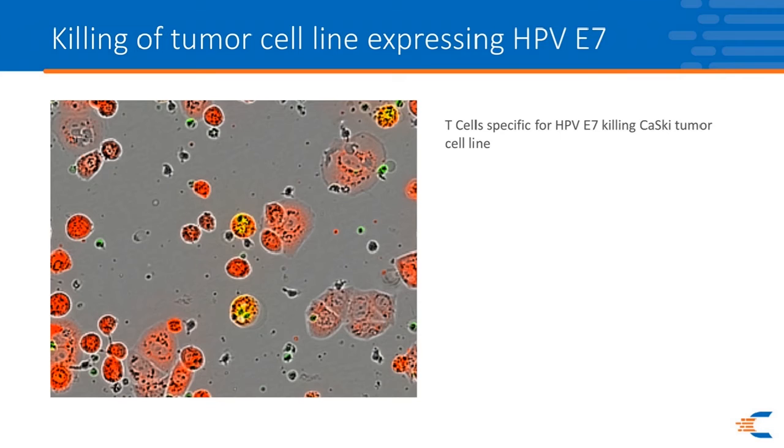You can see that most clearly by this yellowish color, which is the overlay of the green. In this case, it's a caspase label. So the green color within a red cell shows up as this yellowish color. And so then you have 3 cells that are clearly expressing both red and green labels.